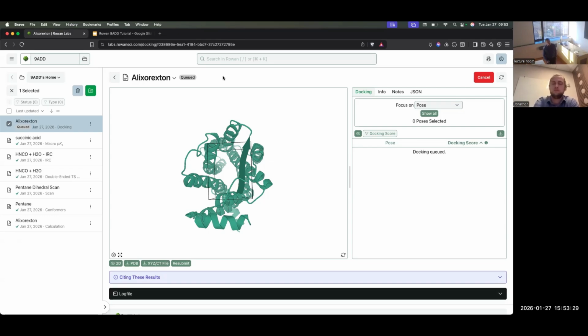And if there are some missing residues completely, you didn't remodel them? We do not add missing residues. That's on our list to do, but it's hard to do it in a kind of a foolproof manner. So if you have a structure with missing residues, you'll at the moment have to go in and edit it yourself. Okay. Maybe some other questions?